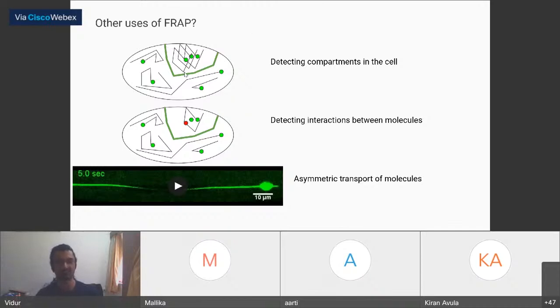And because generally you do photobleaching on a point scanning confocal, you have a pinhole which reduces the Z in which you're imaging. So inherently you will be assessing kinetics only in a two-dimensional front, with the third dimension being much slower than the X and Y axis. So you can neglect the Z axis.